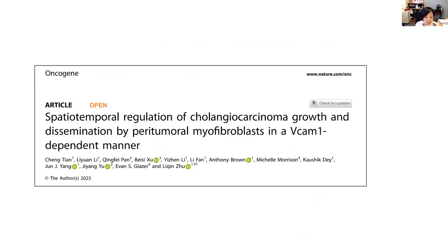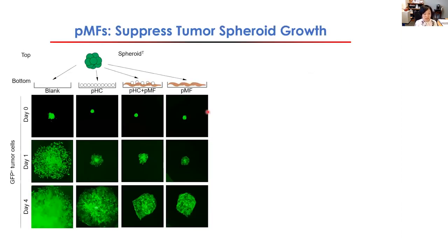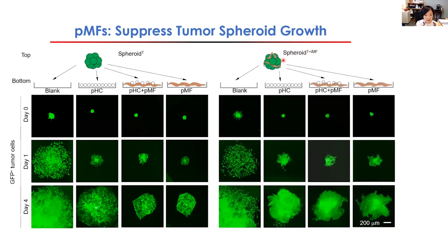So the main message in this study is that, just as in the 3D suspension co-culture that I have shown before, when we have the PMFs plated outside the tumor spheroids, indeed they have a very strong tumor suppressing effect in terms of tumor growth. The tumor spheroids expand much, much more slowly when there are fibroblasts plated outside of them. And when we mix the fibroblasts within the tumor, they actually promote the spheroid growth. But even when the IMFs are promoting, if you have PMFs, then the sphere expansion is also slowed down.